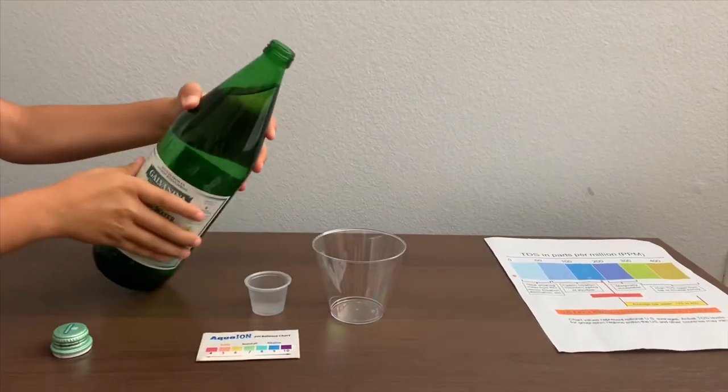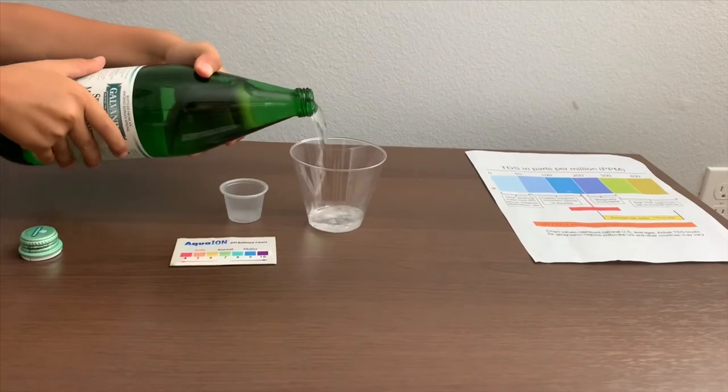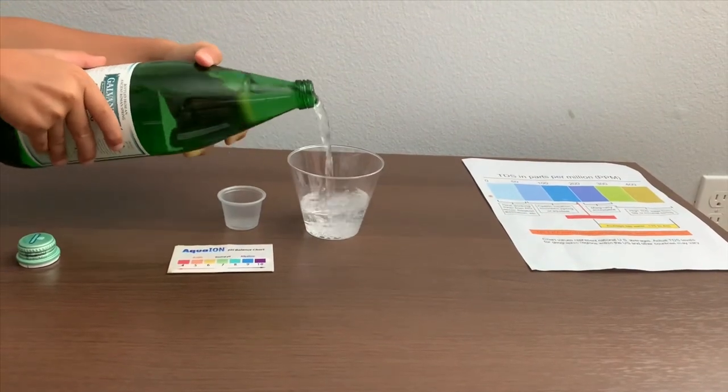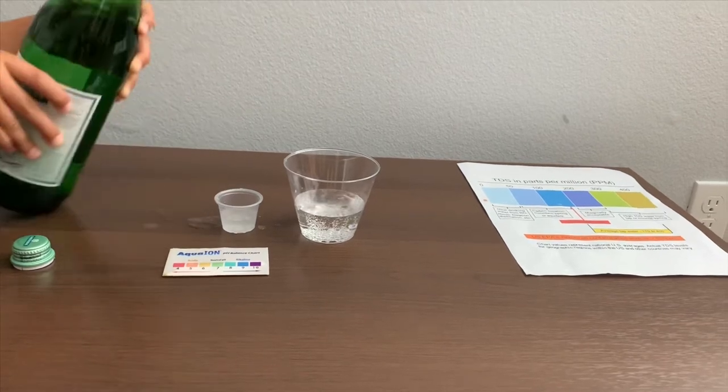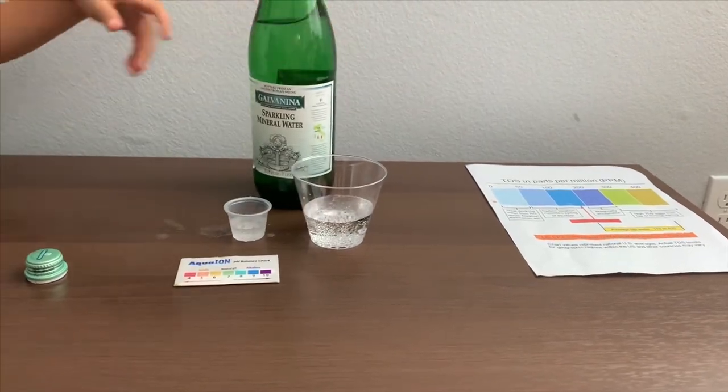Let's pour some water in. First, let's test the TDS level.